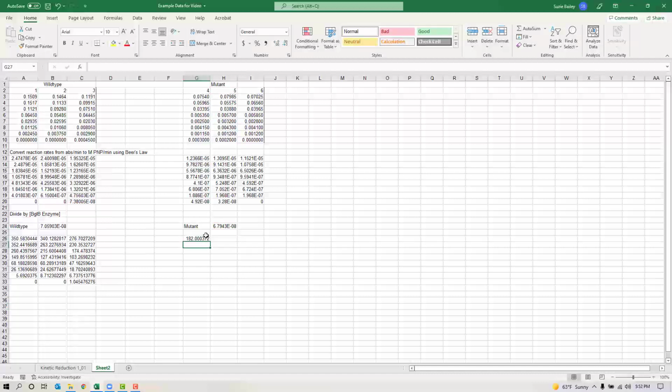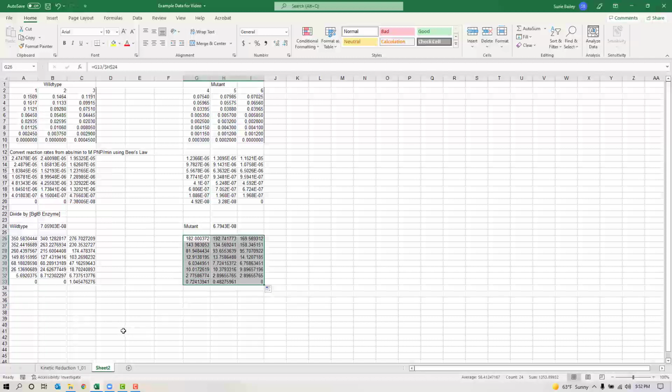So Excel is going to use that same number for all of these calculations that it's going to do, right? So again, we can click through here and just verify G19, yep. And it used H24, yep. So everything looks correct there. Click and drag to copy that formula over the other 2 columns of replicate data, and we are done.